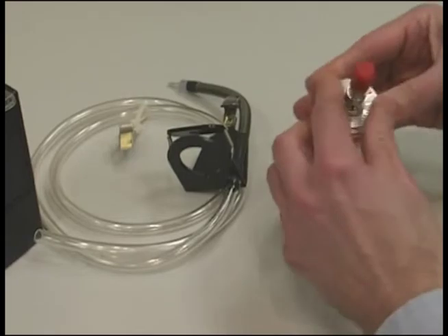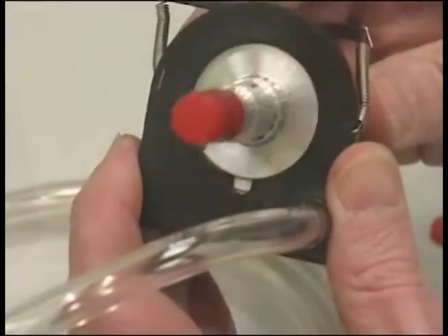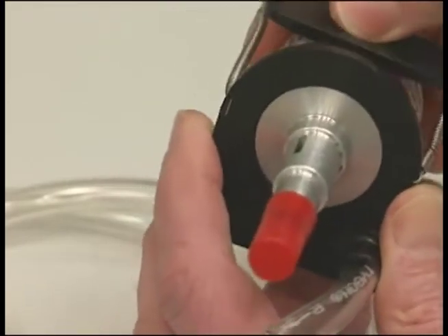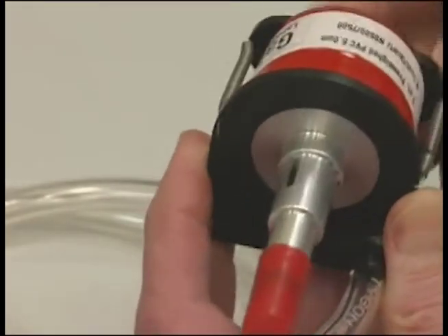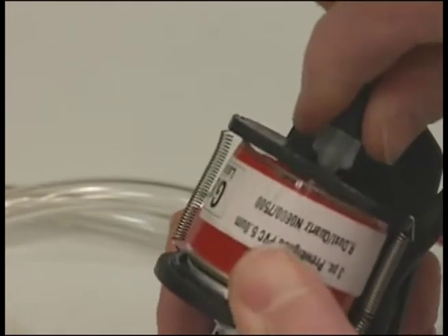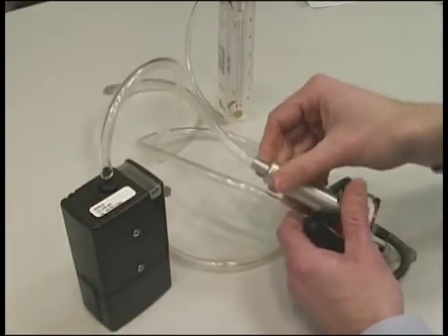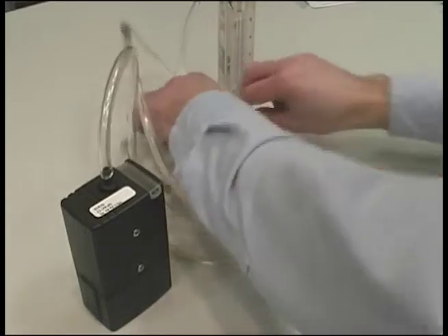Place the attached filter cyclone in the cyclone holder, inserting the cyclone side pin into the notch in the filter cassette holder. Then attach the tubing from the pump. Slip the aluminum calibration chamber over the bottom portion of the cyclone, and you are ready for calibration.